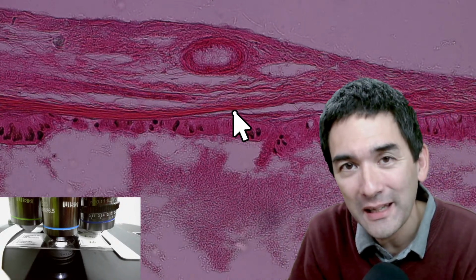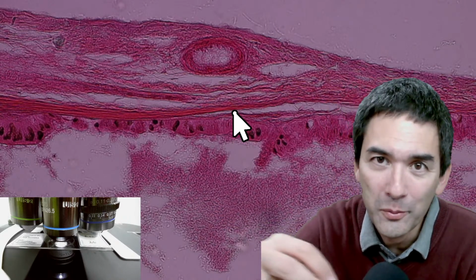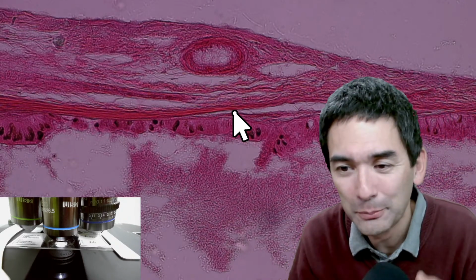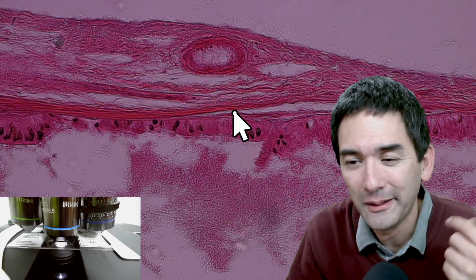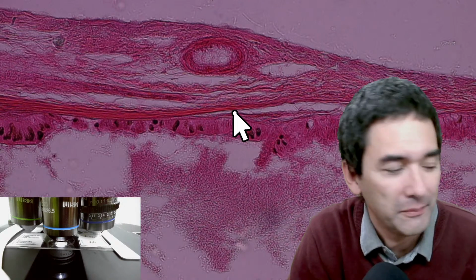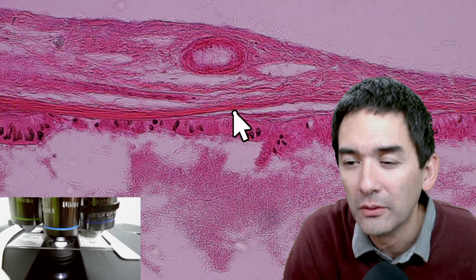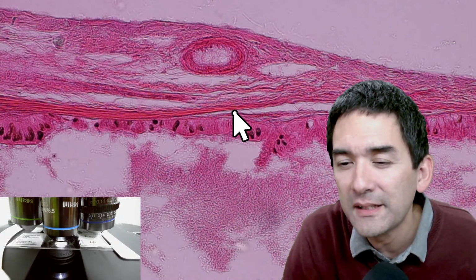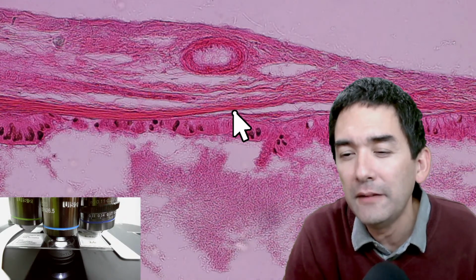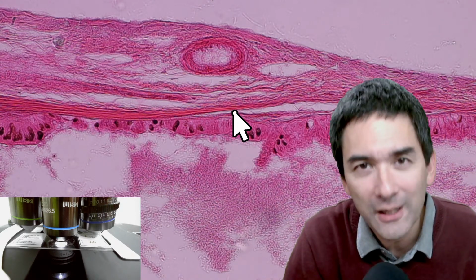Then you have to again treat it with xylene in order to remove the wax, the paraffin. So you see, it is a pretty elaborate process, and for this reason, I would say not so many amateurs do that, but I've heard of a few people who actually do. Formalin is a diluted formaldehyde in a buffer solution. Interesting. Yeah, I'll leave it to professionals. I think botanical sections are easier.